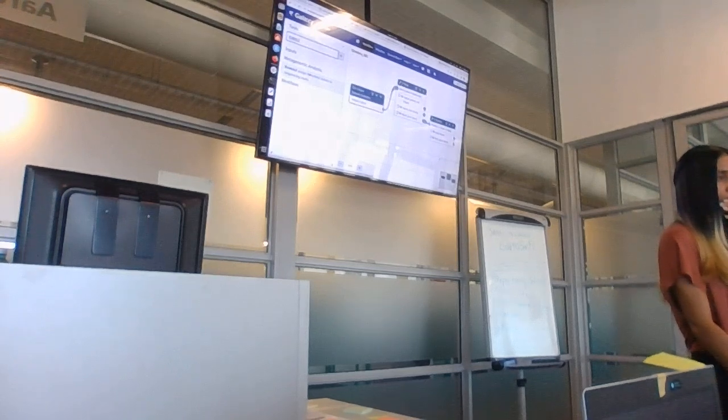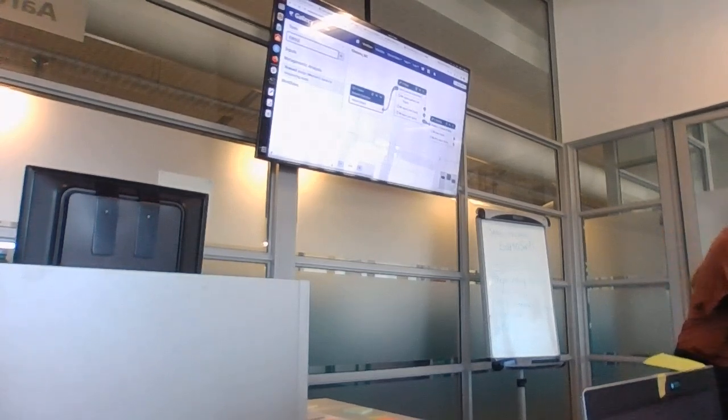So this one to create. And this can have a color. So this is just a way to get your workflow, but you can also use it to edit the workflow. So in our case, we are going to now add Kraken to this workflow.